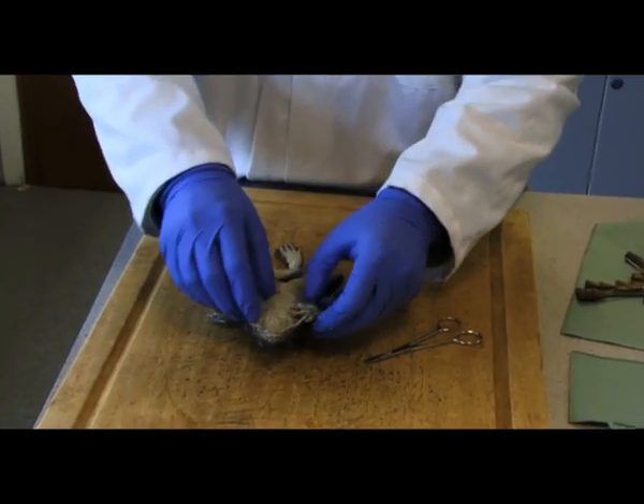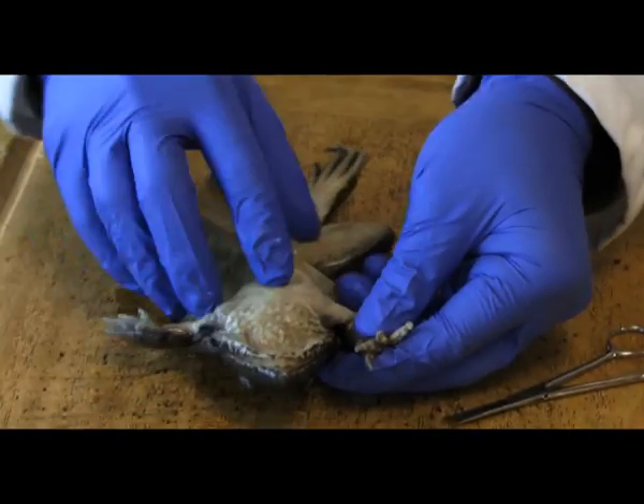Now we move on from there and we start looking at the internal structure of the frog.